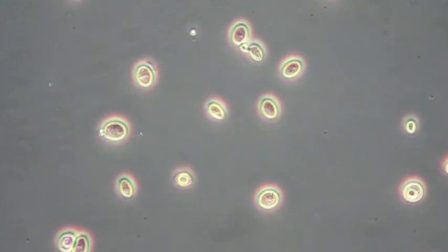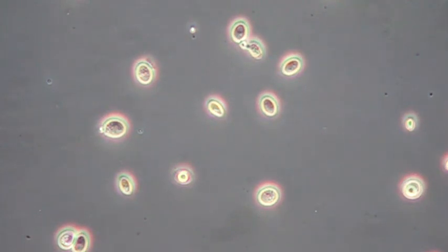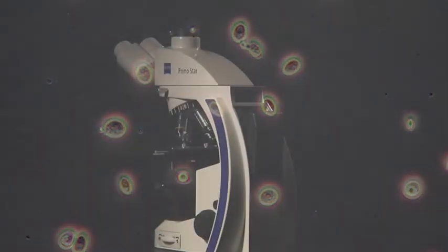Most yeast and bacterial cells are smaller than 10 micrometers. For direct visualization of single cells, a light microscope is needed.